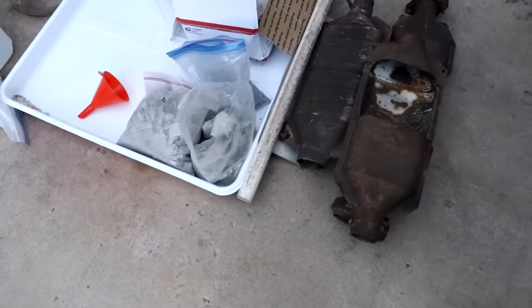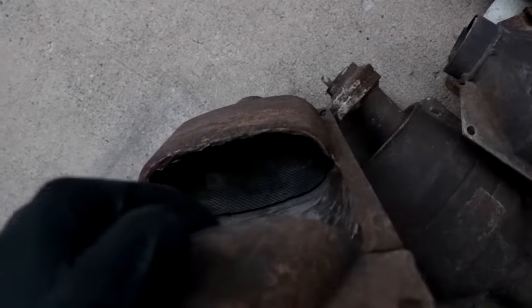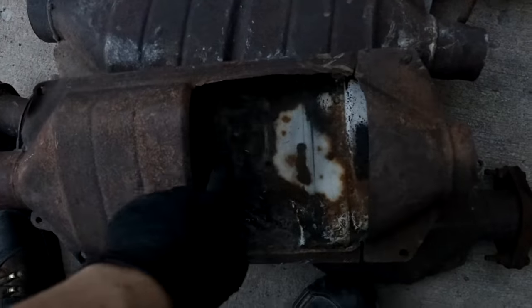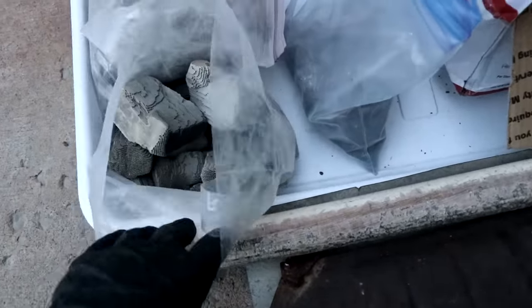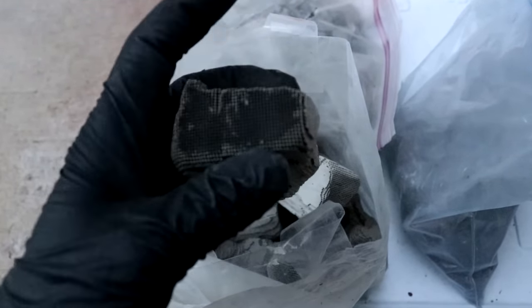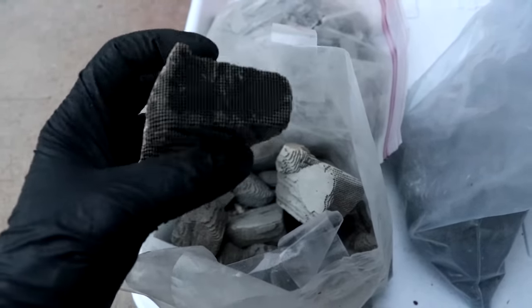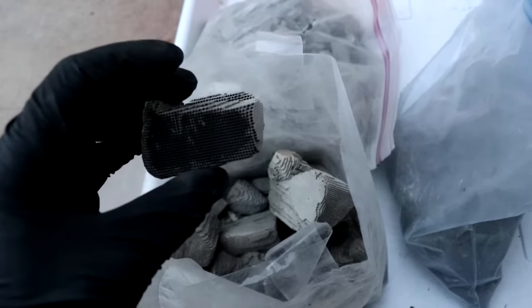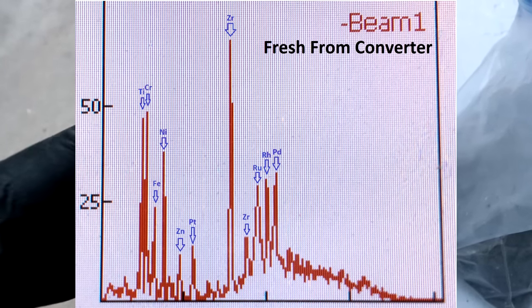Let's take a closer look at what we've got over here. We've got three catalytic converters — one of which I've cut open so you can see inside. There's the catalytic material right there. The material looks like this; people call it honeycomb but it's actually got squares so I wouldn't really call it honeycomb. The material is made of a zirconium dioxide ceramic with an aluminum wash coat, and the precious metals are in that outer wash coat. I checked these with my X-ray fluorescent spectrometer and I do see spikes in the data indicating platinum and palladium.